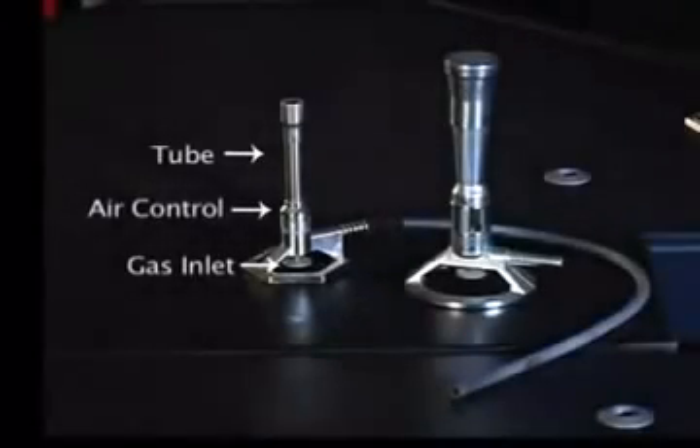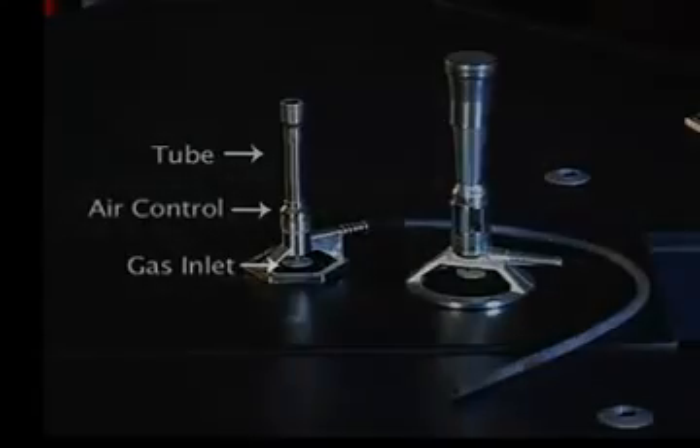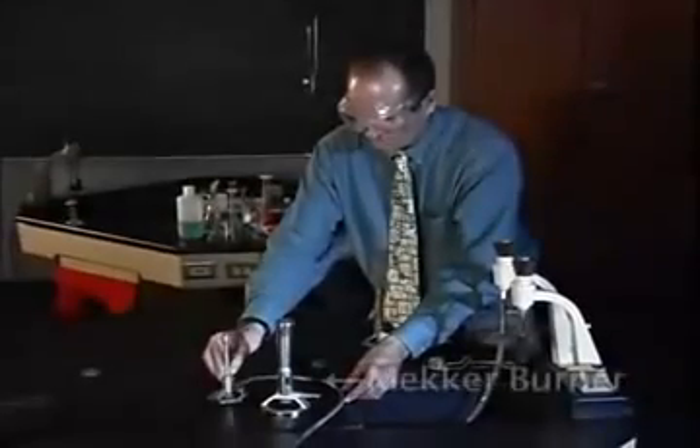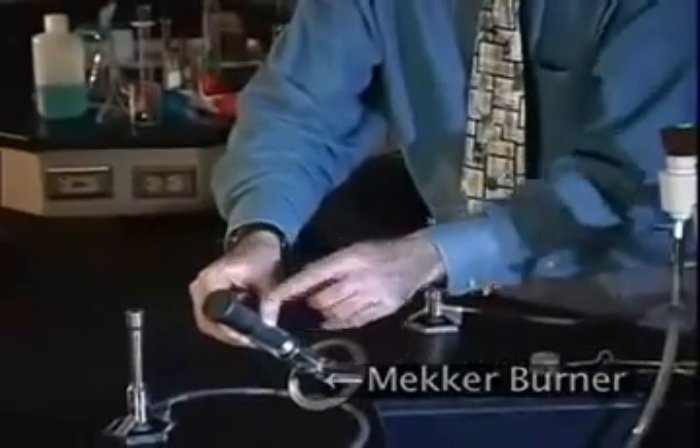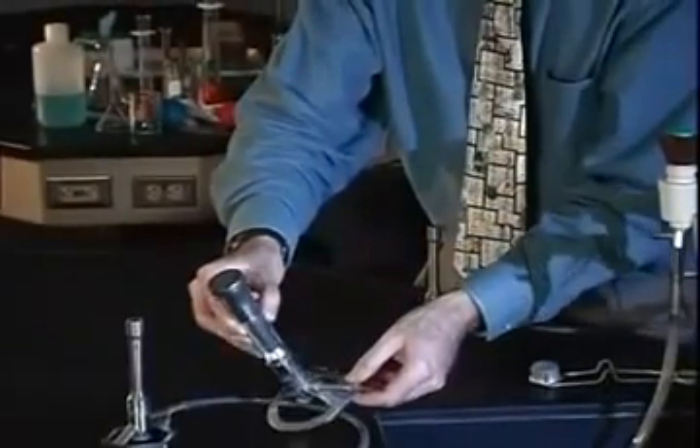A typical Bunsen burner consists of a tube, an air control, and a gas inlet. All burners are a variation on this original design. For example, this Meeker burner has a mesh top designed to produce numerous tiny blue cones for an extremely hot flame.